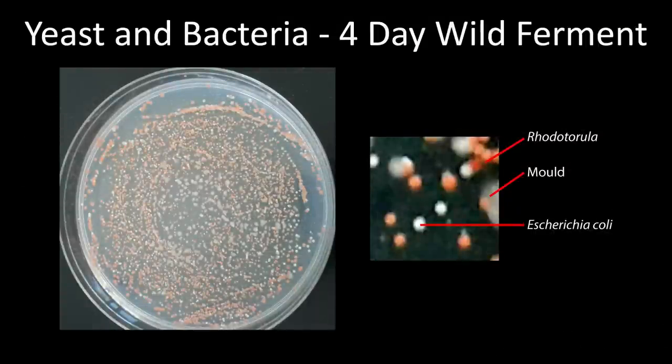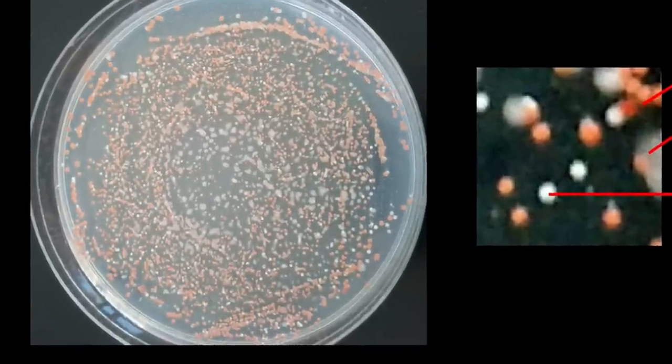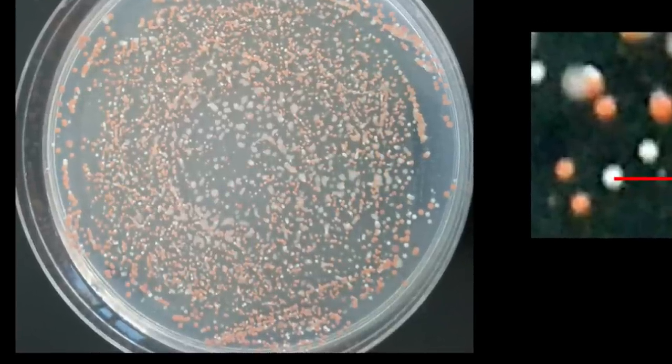Here is an example that readers of my blog will likely recognize. This is a plate of wild yeast plated out just four days after capture — far earlier than you would ever want to be pulling organisms. You'll notice a lot of pinky-red colored colonies. These are a wild yeast called Rhodotorula, which is actually a potential pathogen — not something you would want to eat. The other colonies are actually mostly Escherichia coli, again another potential pathogen you wouldn't want in your beer.